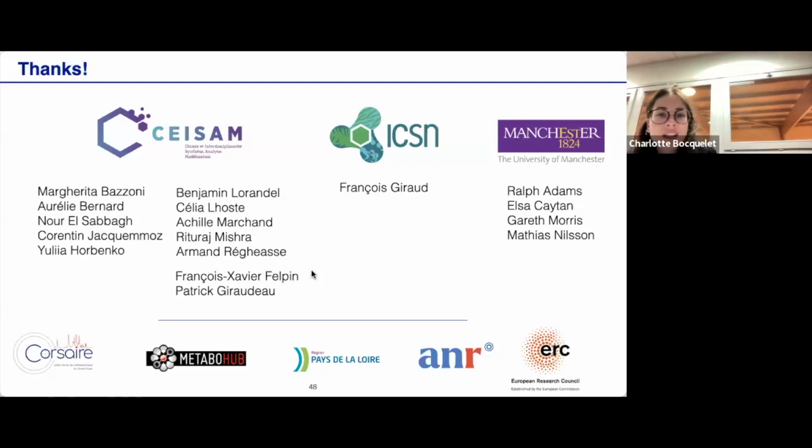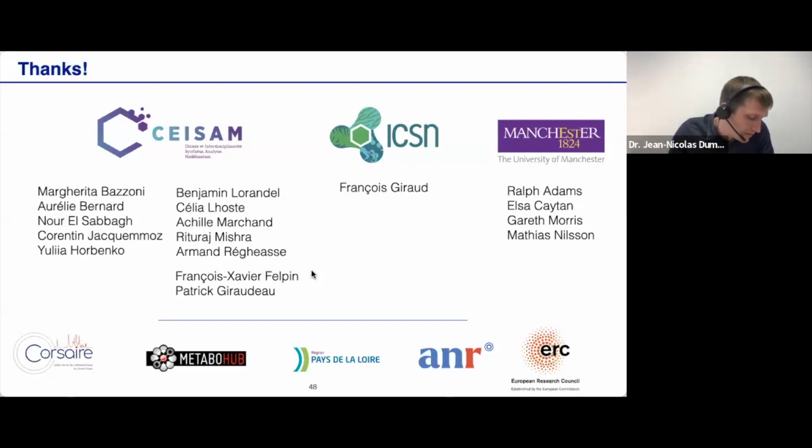Next question is, how quantitative is the pure shift method? Do you have to use substrate and products as a reference? Just curious, as in a Bruker webinar, they mentioned something about a lack of quantitative feature. Again, very good question. Thanks a lot. I guess one has to be clear on what one means by quantitative.